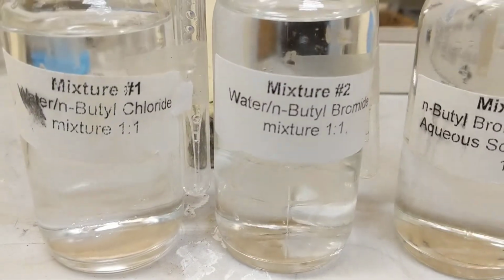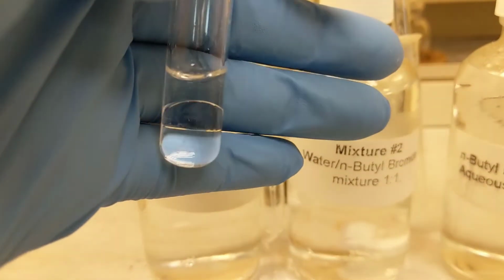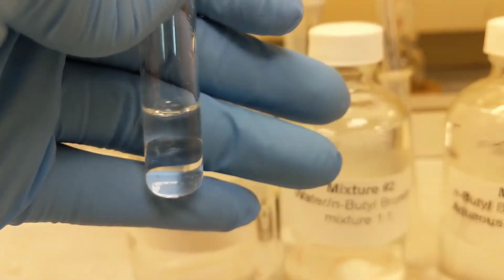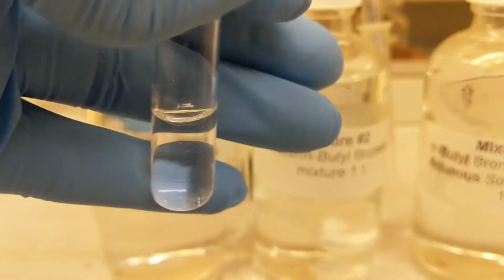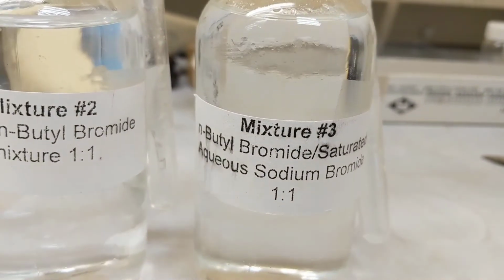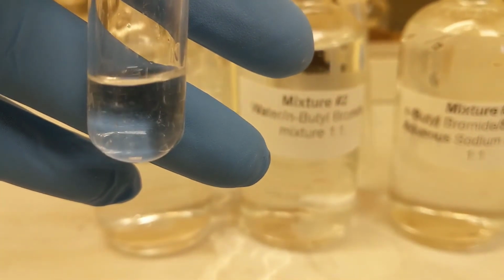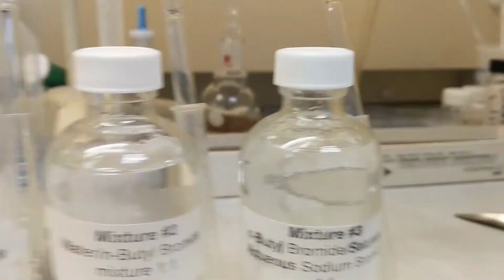Mixture 2, water and N-butyl bromide. We have two distinct layers, you see? It's forming an interesting shape. So, water and N-butyl bromide, which is on top, which one sinks to the bottom? Mixture number 3, butyl bromide and saturated aqueous sodium bromide. Here we go. You see, still two distinct layers. Question is, which one floats, which one sinks? That's the end of experiment 3C.